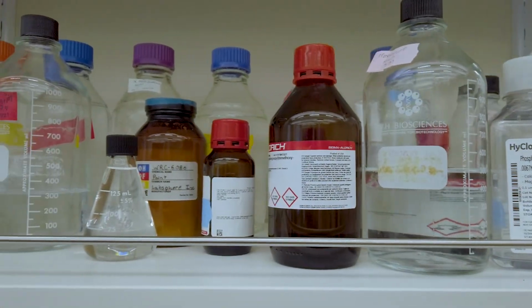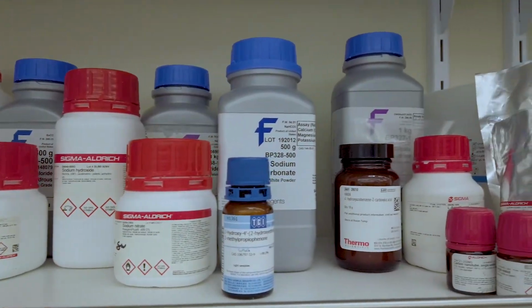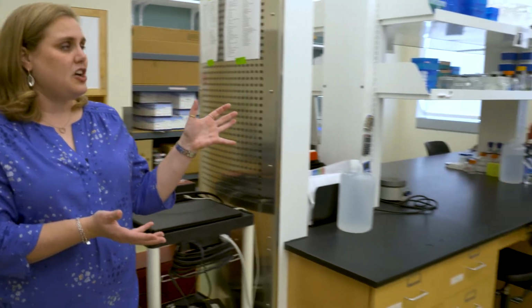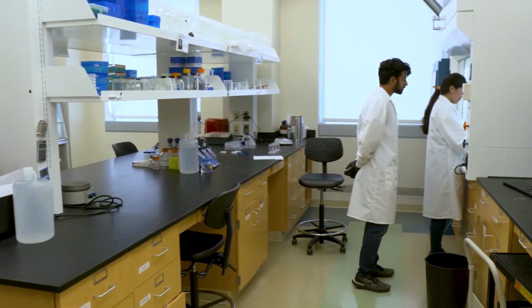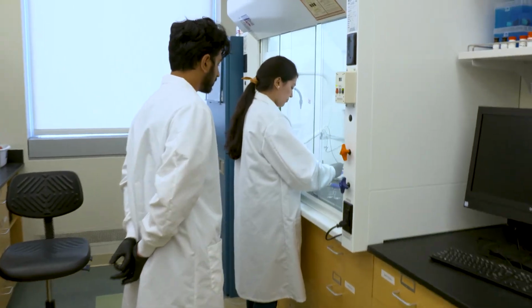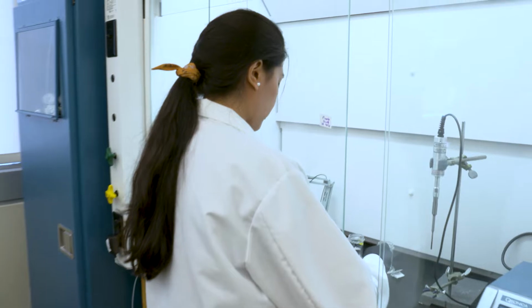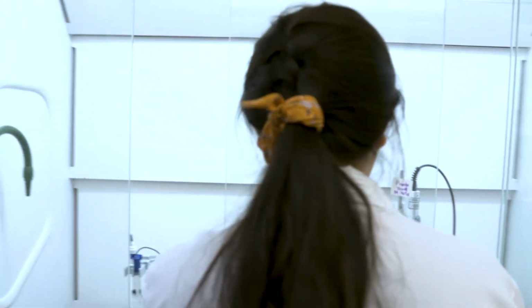As we continue on in the Iverson lab, you can see that we have a nice setup to do a lot of different chemical wet-based research. This is a pretty typical chemistry type lab. Over in the corner over here, we have 2 of my students, one graduate and one undergraduate student. They are working in the chemical hood. They are currently creating slides that have carbon nanotubes adhered to the surface.